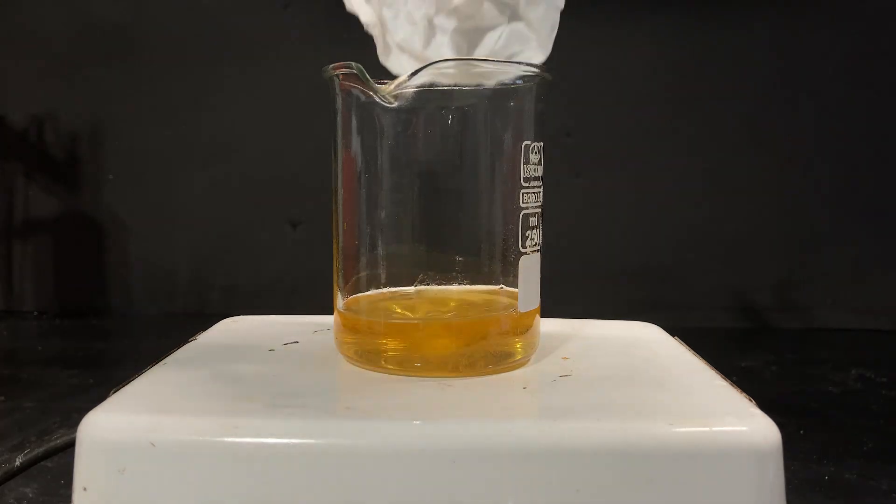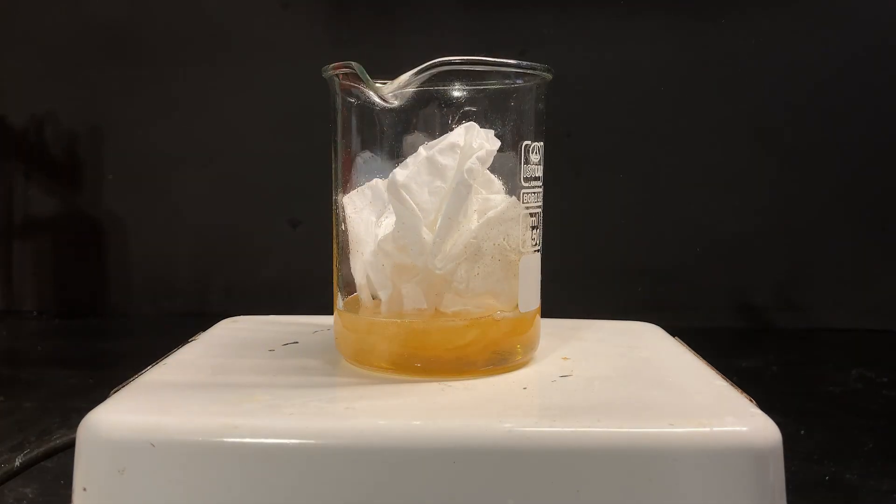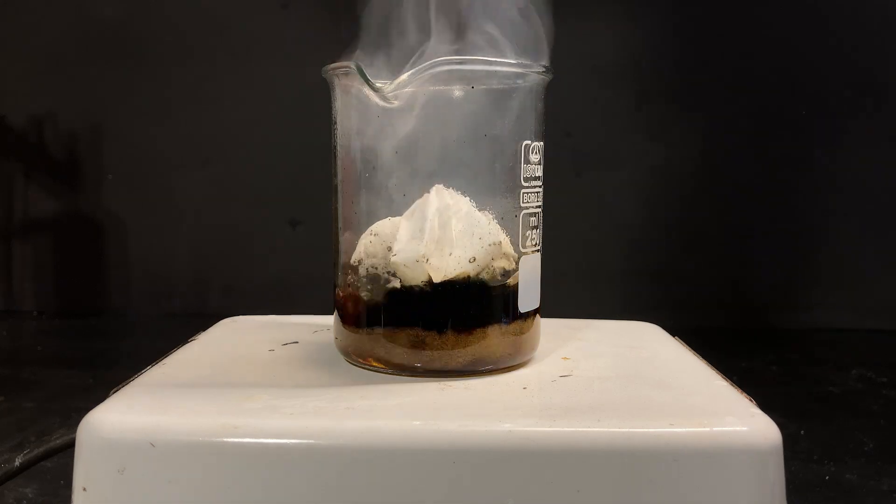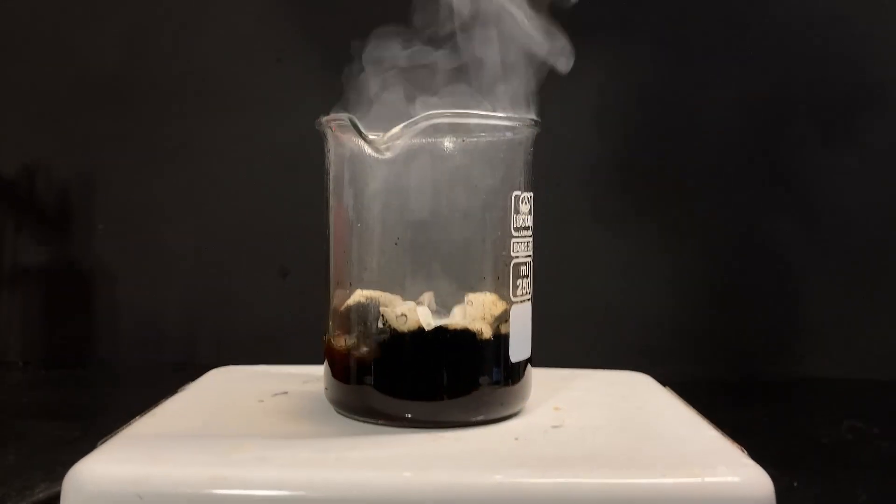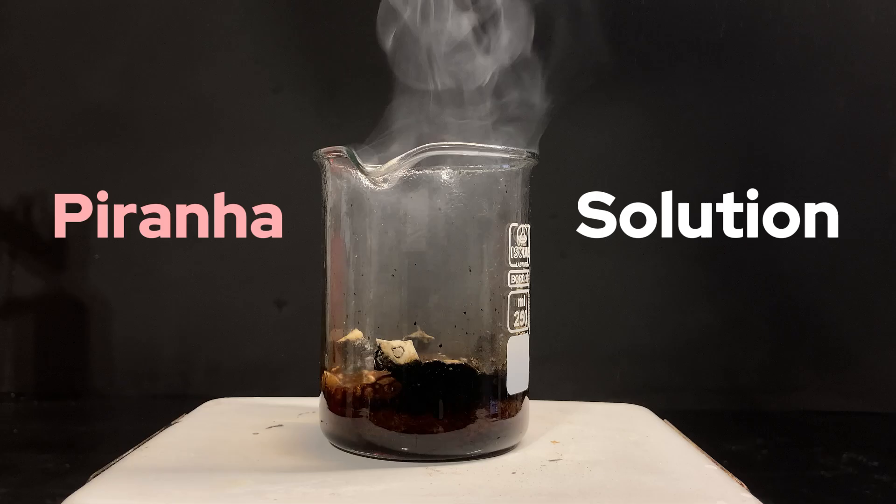Today, I'll be making possibly one of the scariest solutions in all of chemistry. That's right, it's peroxymonosulfuric acid, otherwise known as the Piranha solution.